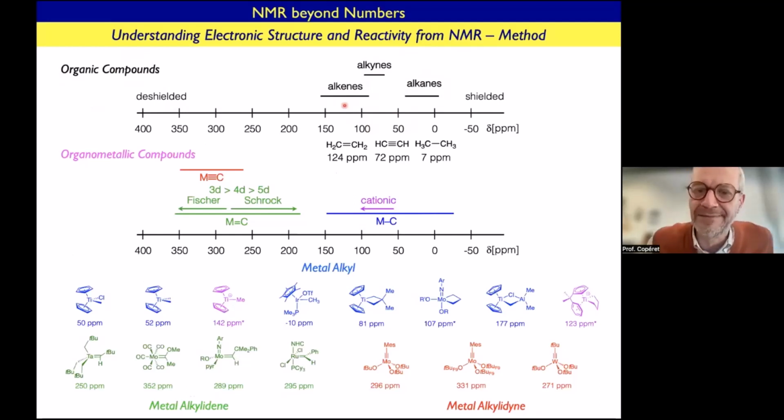If you go from organic compounds to organometallic compounds, where you replace one of the pendant groups by a metal, and I'm going to discuss transition metals today, the chemical shift window opens quite a bit. You go from typically 0 to 150 ppm, which is classical, unless you discuss ketones, to something much broader, which spans between minus 50 and easily 350 ppm.